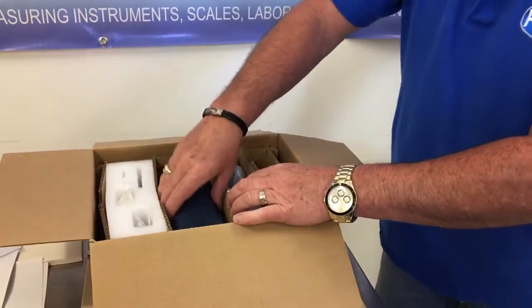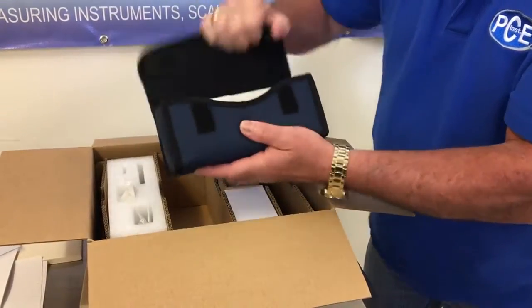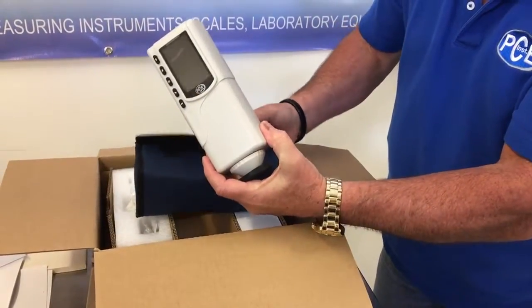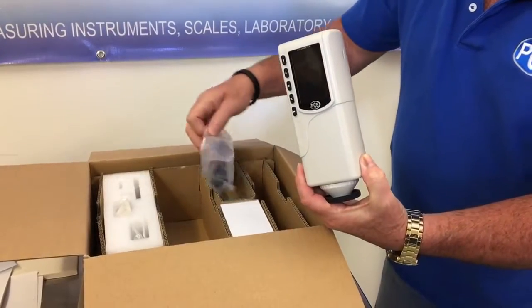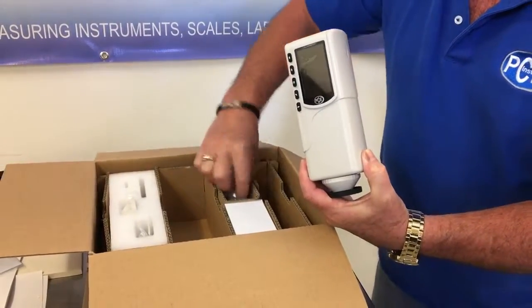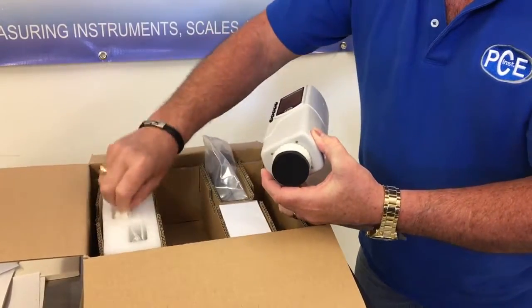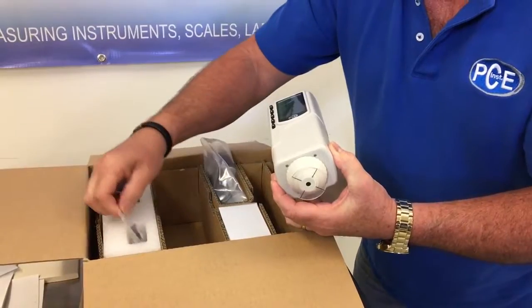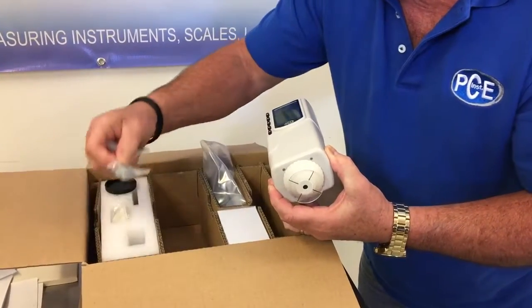We have a nice case for the color meter with a handle. This is the PCE CSM1 color meter. We have a power adapter, we have the USB cable, we have another adapter that goes on the end. This is a dust cover. Also we have the white space and a carrying strap.